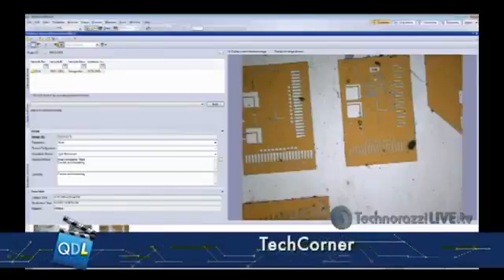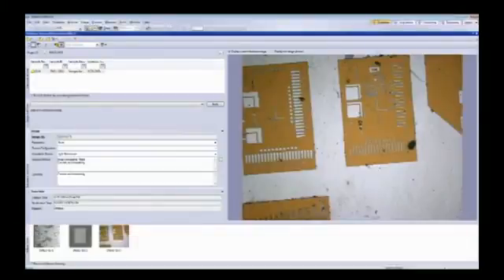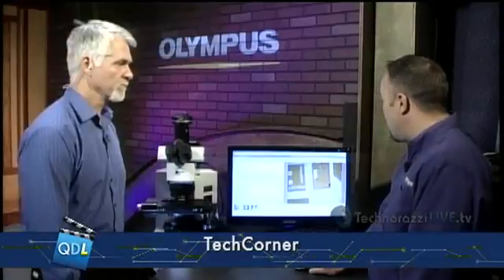So today, some of the quick things I'll cover in the Stream 1.9 software are the new features. The software does incorporate a very integrated database tool. There are several new features that I can't cover all of them in the time we have, but some of the new features for the database tool are like copying fields and being able to paste them quickly into new inserts. The database allows archiving of your images and measurements and reports that are generated, and to be able to search through them quickly later and share throughout the network of users in the company, I would imagine.